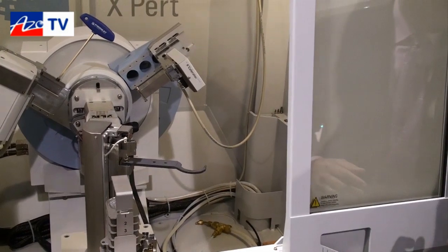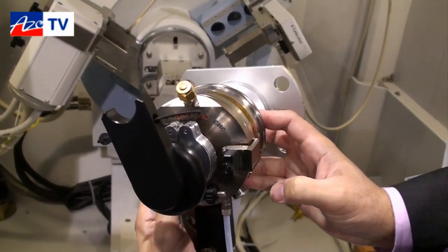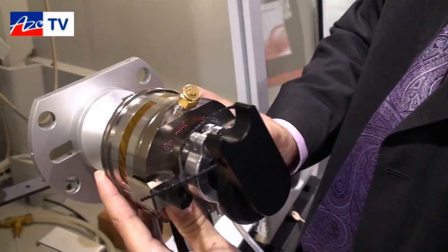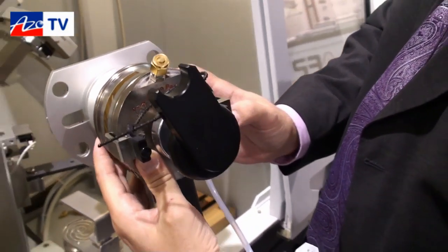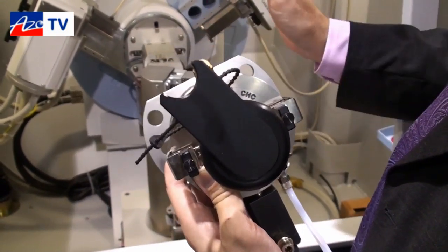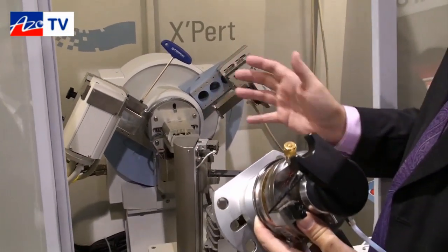On the Expert Powder system, we're also able to change the sample stage. For example, here is the Anton Parr CHC combined humidity chamber, which looks at samples in a relative humidity environment from 0% up to 95%, and up to a temperature of 400 degrees Celsius. Exchanging the stage is very simple — it's PreFIX mounted so you can remount the stage without any alignment. All optical components, whether configured at delivery or added later, are always permanently aligned.